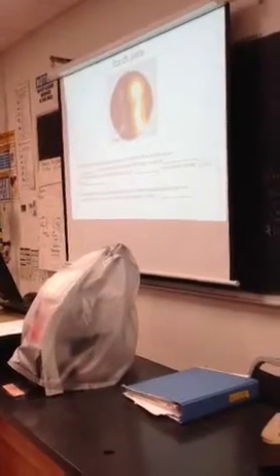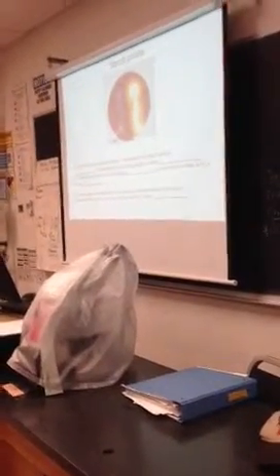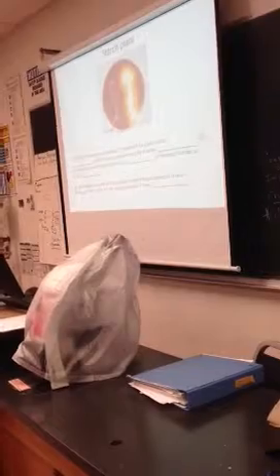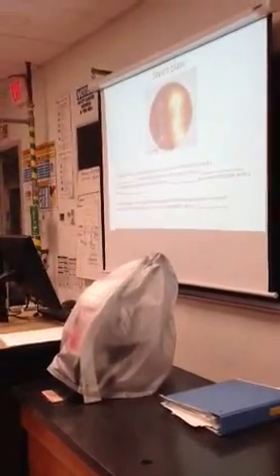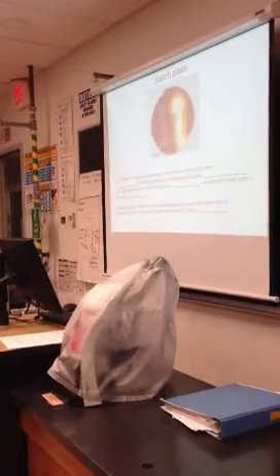Why? Iodine reacts with starch to produce a purple color. So if the starch is gone, you have a zone of clearing. Okay? So look up there. Is the E. coli positive or negative? Negative, because there's no zone of clearing. The one on the right is Bacillus subtilis, and it's definitely got a zone of clearing.